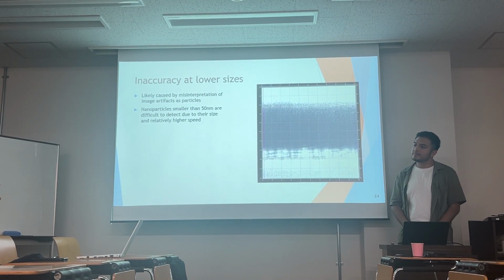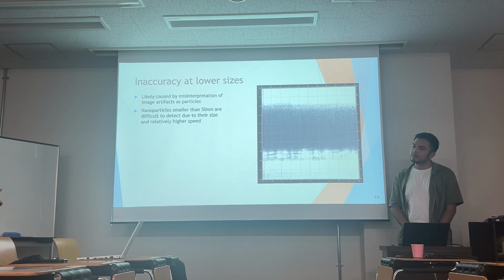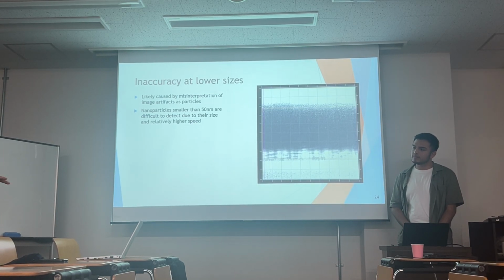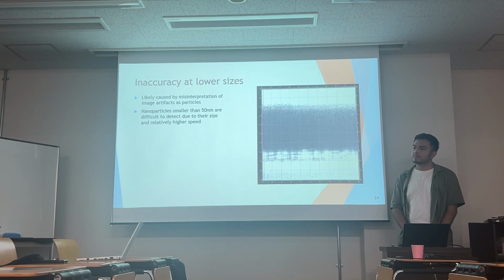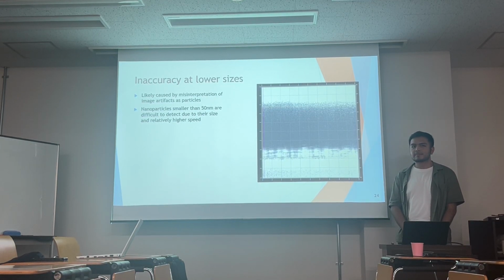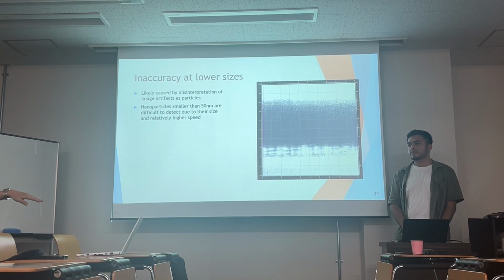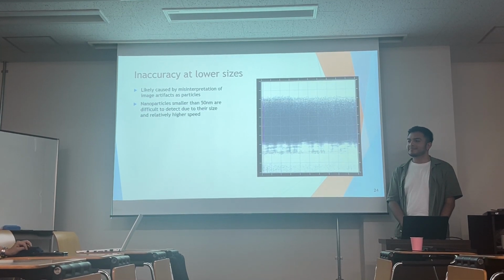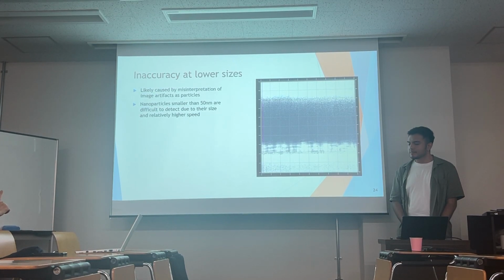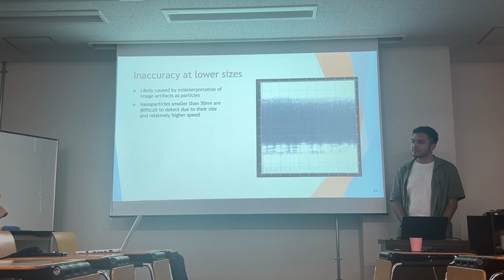Probably our system can eliminate such peripheral collisions from the analytical regions. Is that right? Yes. So we can determine the size of the ROI by ourselves.